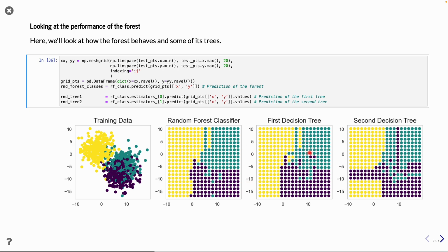And then we can look at the outcome of different trees. And you see here that this one made something quite crazy, and probably the other 4 trees didn't agree on that. So that part is actually rejected, and that is why we get the final solution like this. And you can, of course, train it with more and more trees, but at some point I think you will get overtrained and do a very specific solution on just that.